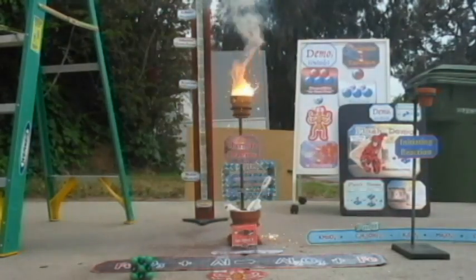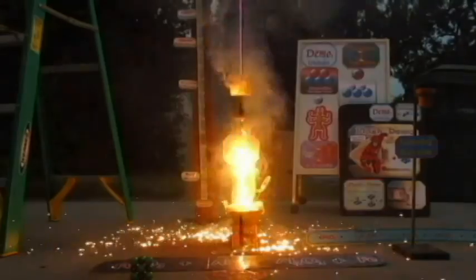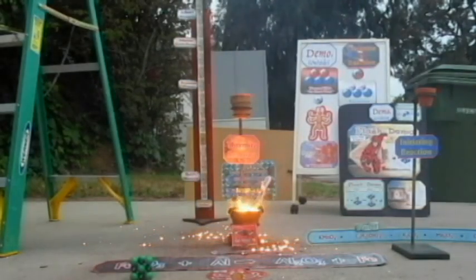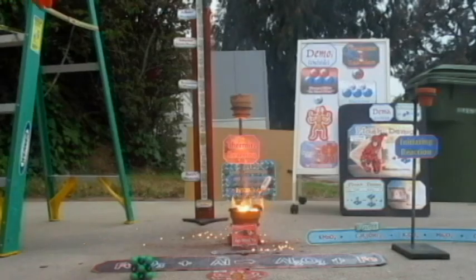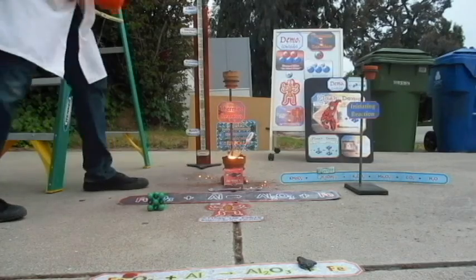Look at this. That's a good thermite. Whole lot of thermite. Molten material flowing out. Okay, let me see. I think the thermometer actually survived. Did the paper burst into flames, guys? Yeah.